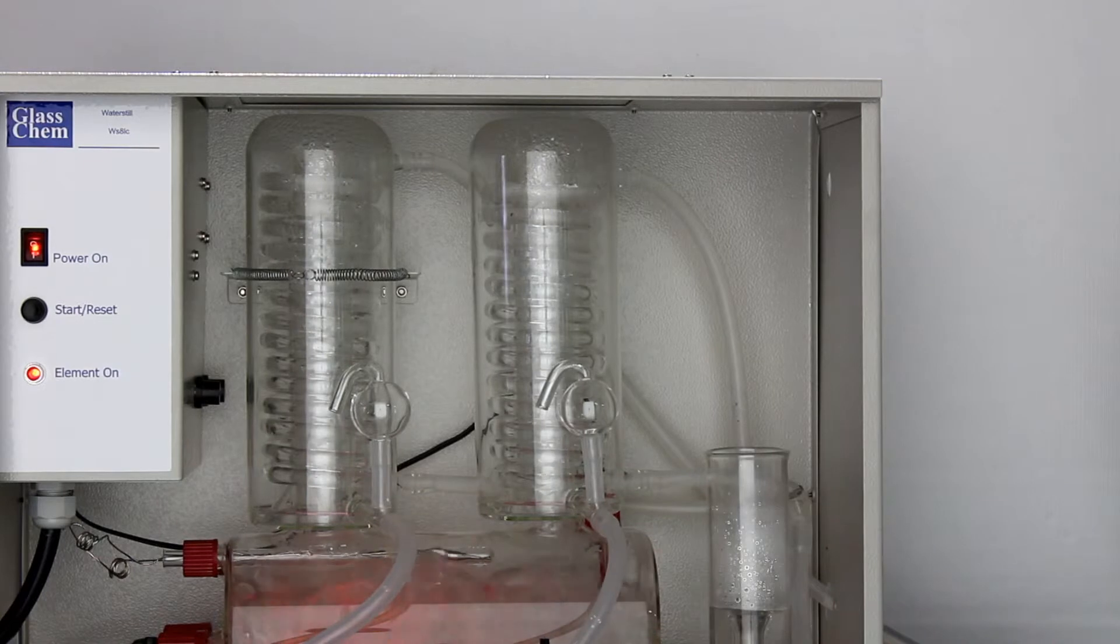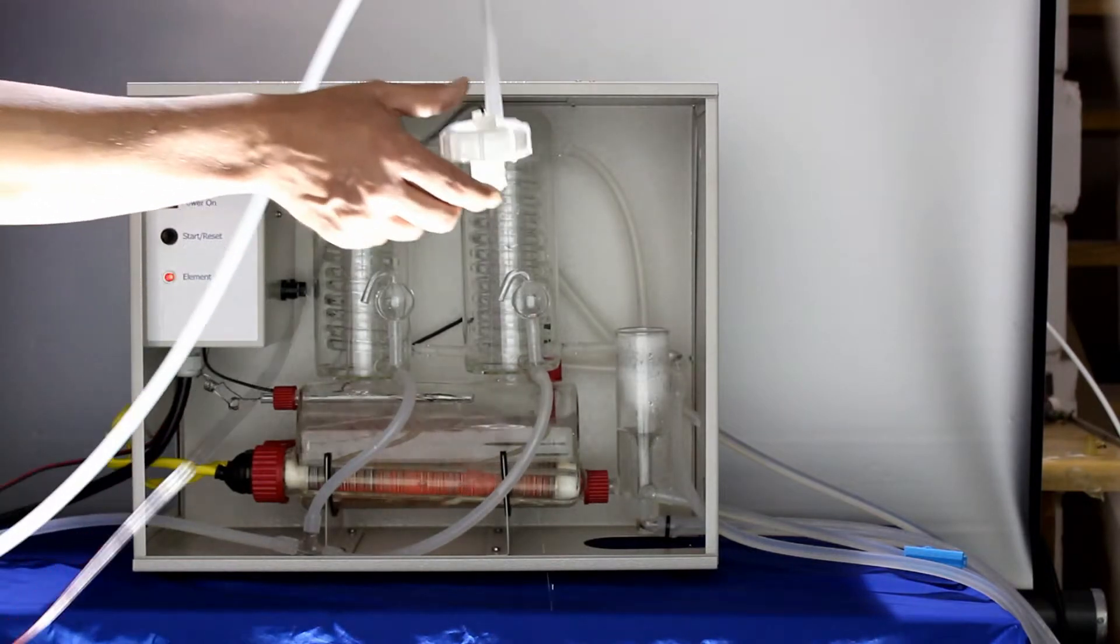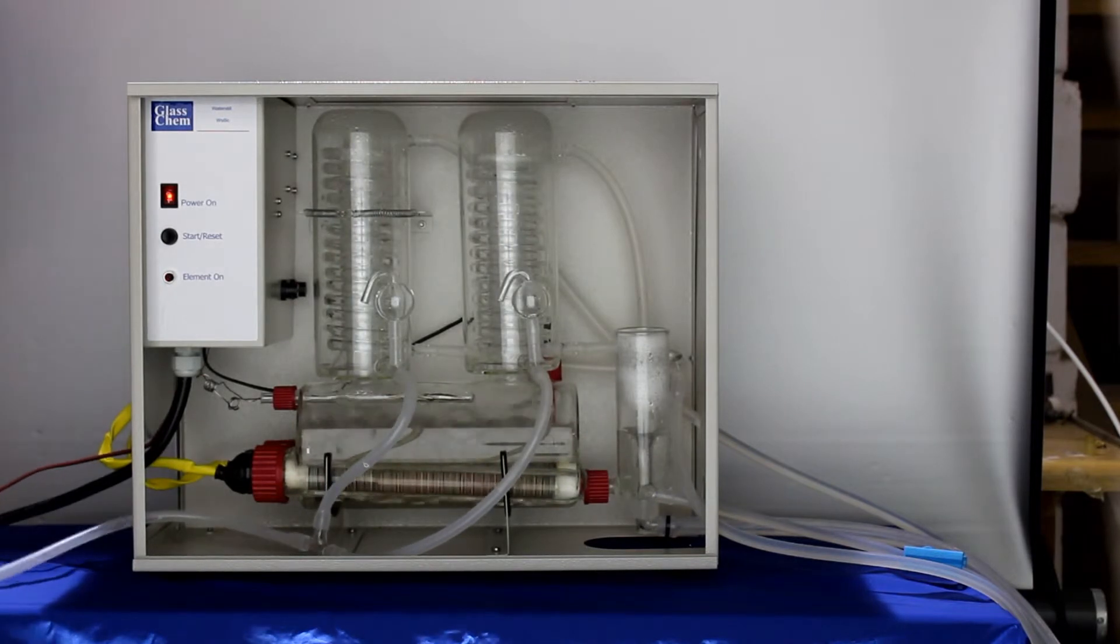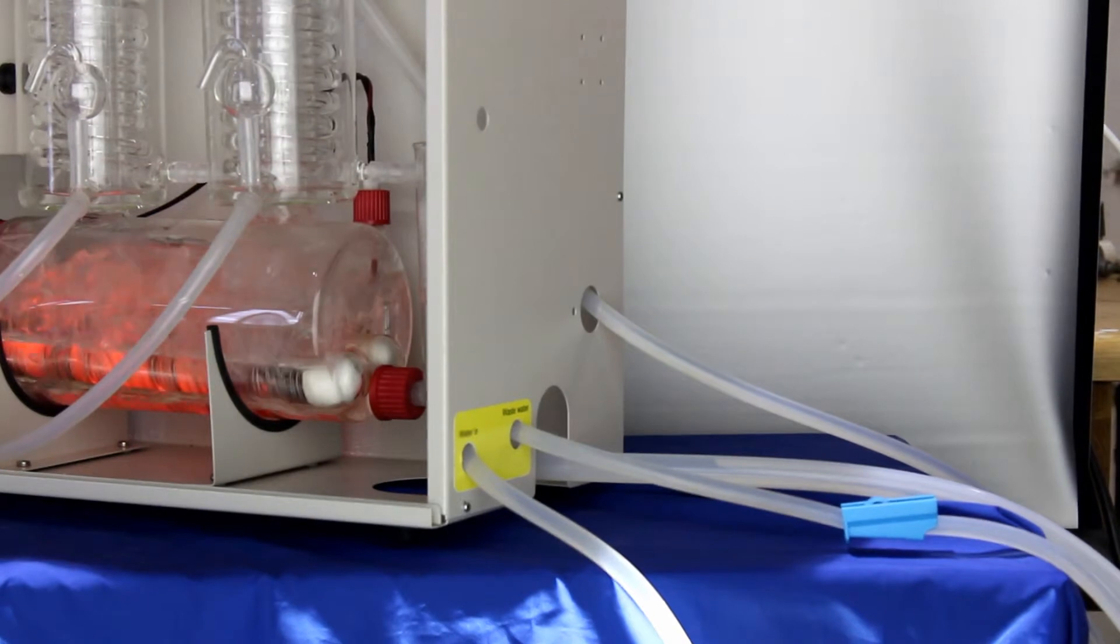The distillate will flow down the tube into the aspirator bottle. The float switch sits on top of the aspirator bottle and will switch the still off when the water level pushes the float to the top of the bottle. The still is now fully operational.